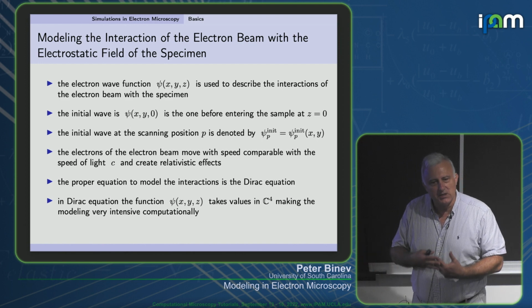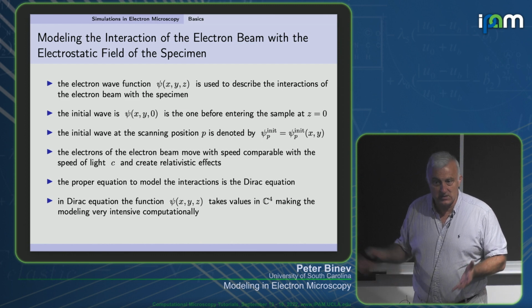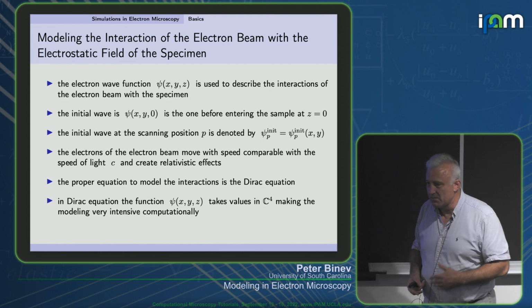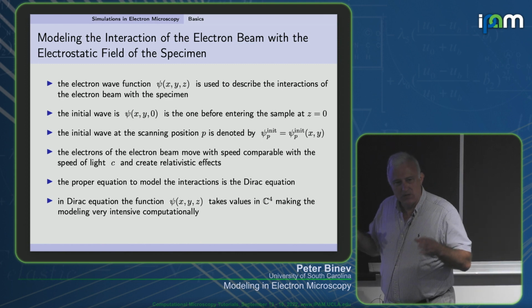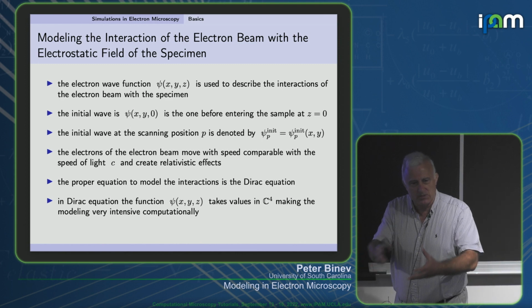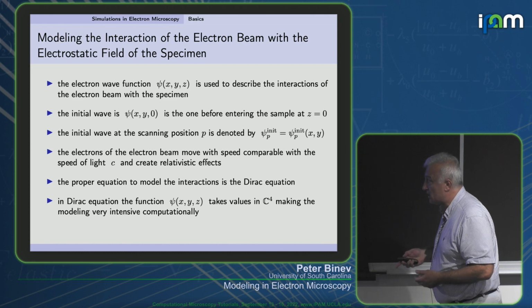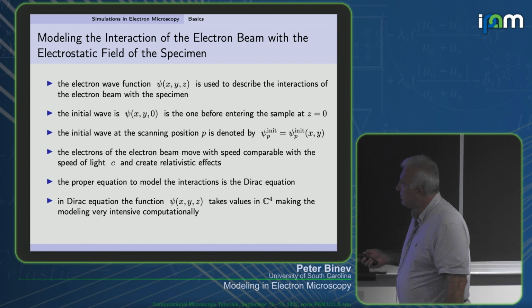You end up with a huge number of simulations, and keep in mind the equations you have to solve are not very simple, so that will require some time. Just to simulate what is happening with one probe you need a tremendous amount of computation, so we have to simplify what is there.